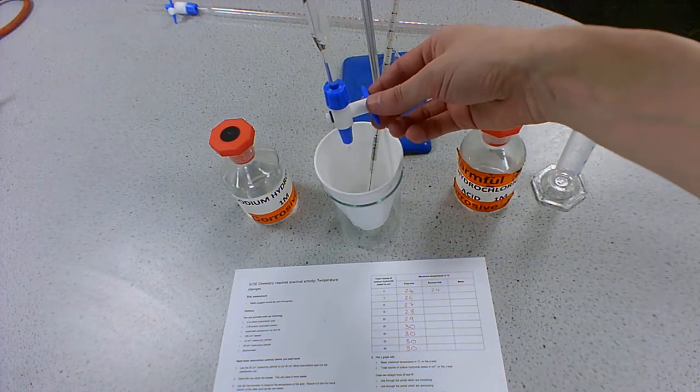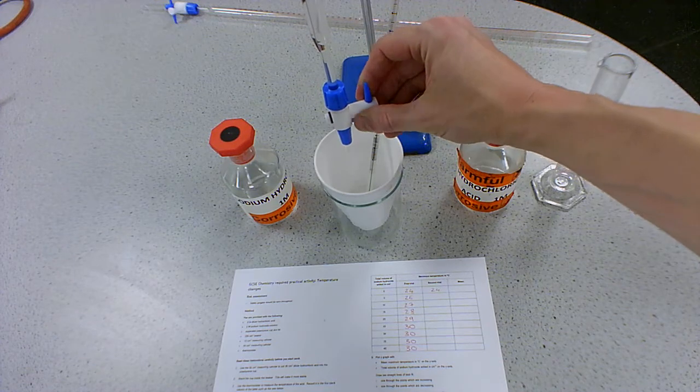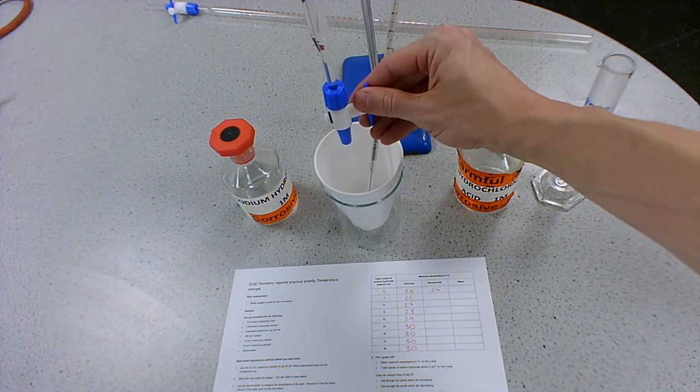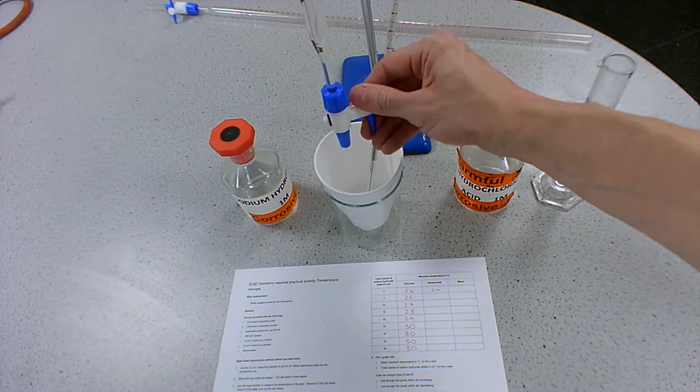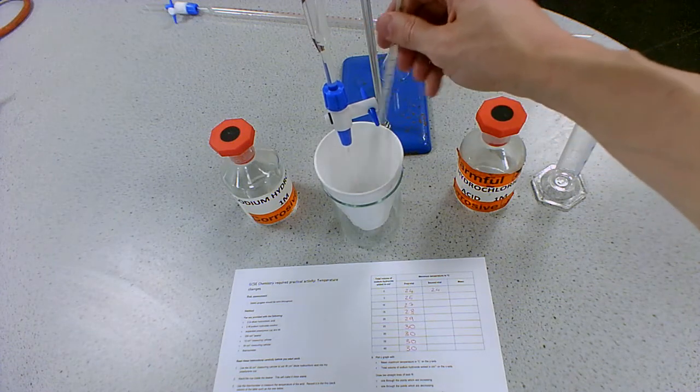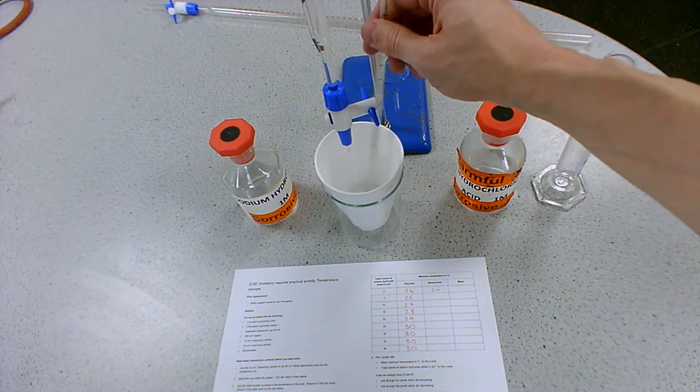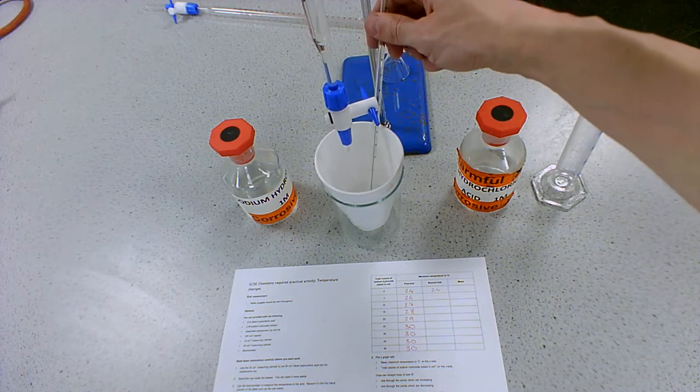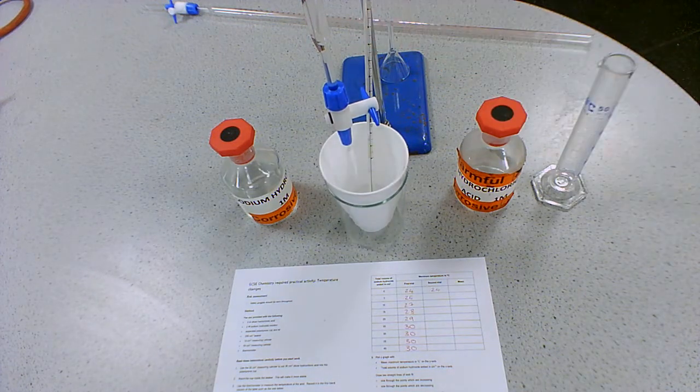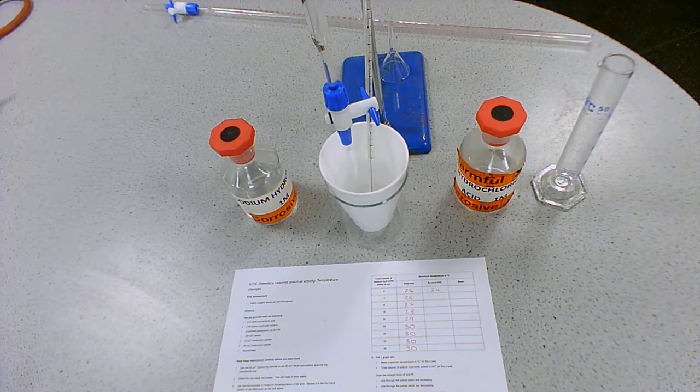And then we're going to add five centimeters cubed, so I'm going to open the tap, let five centimeters cubed be added, and then close the tap. And give it a quick stir, and just wait a couple of seconds, it's going to take a little while for the thermometer to catch up, they're not instant. And then record the temperature, and that is now 26.